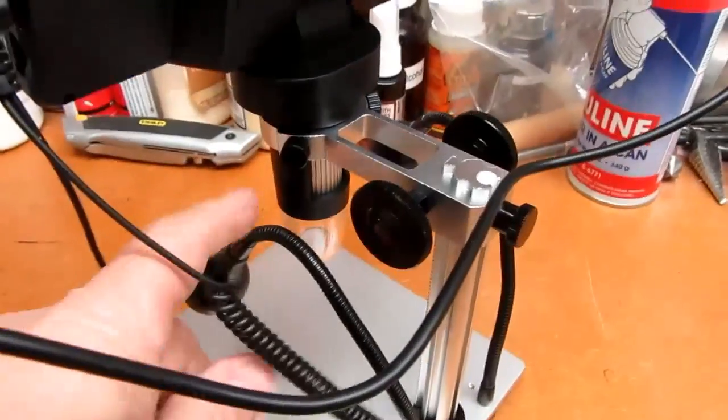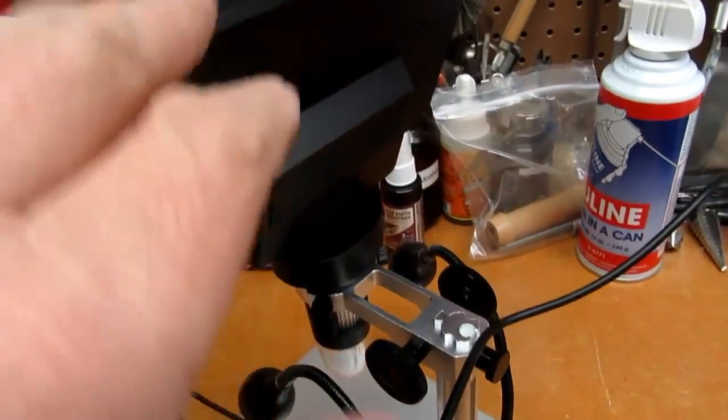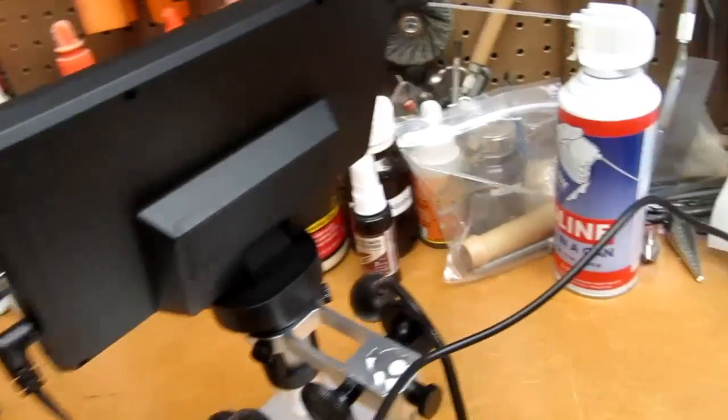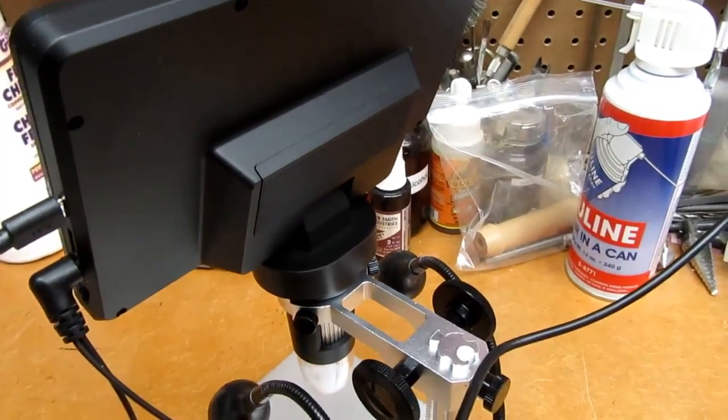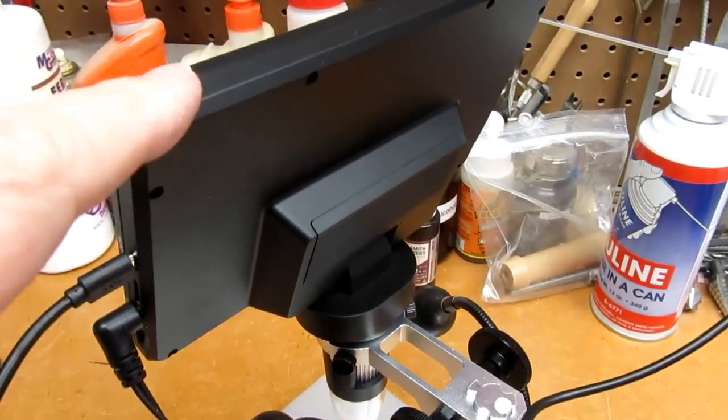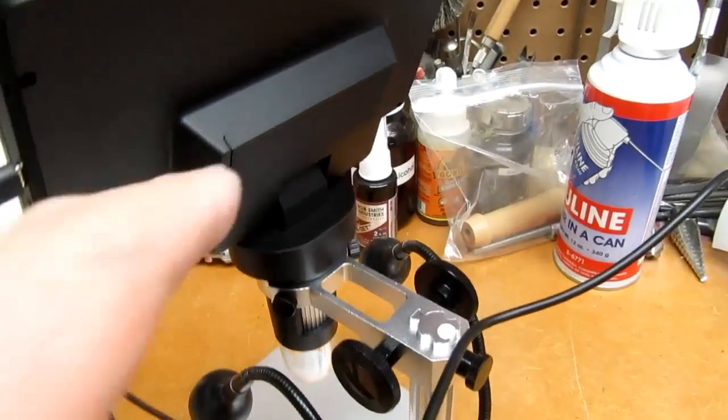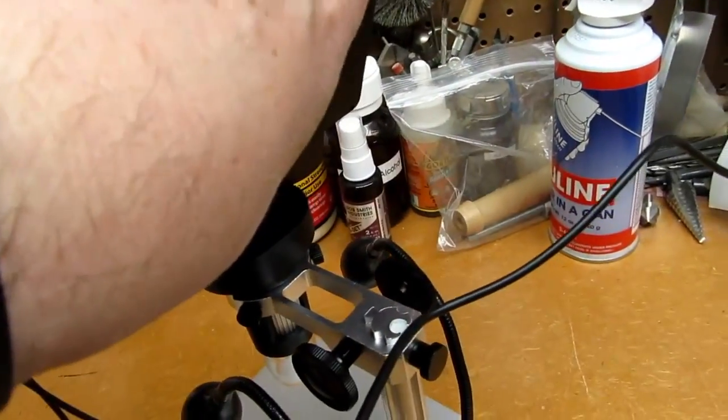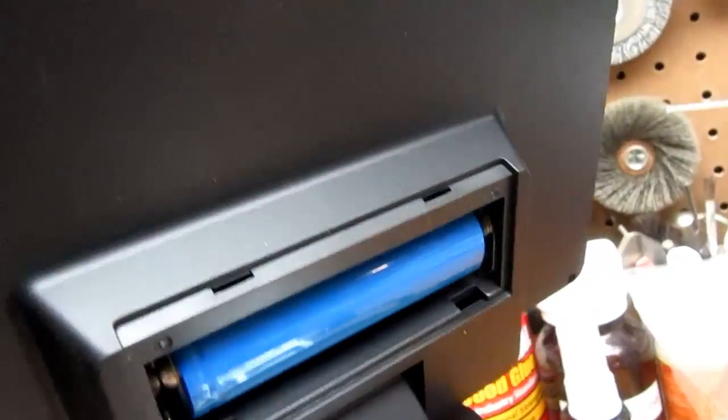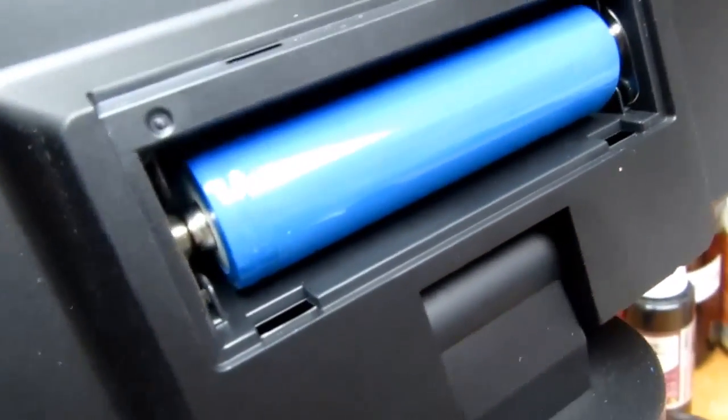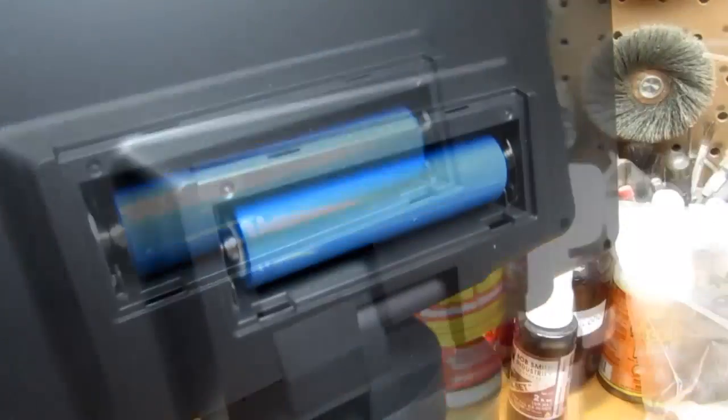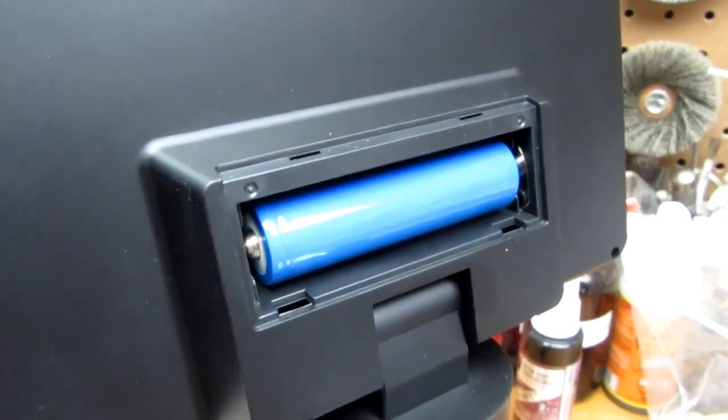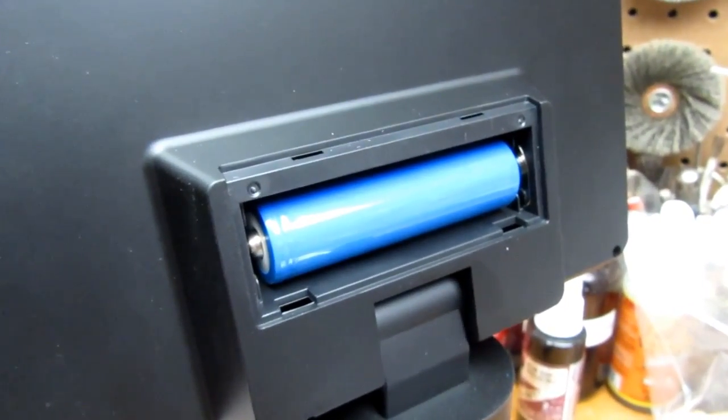The microscope does not come apart from the LCD display. I think the smarts, if you will, the logic circuitry for the microscope is in this part of it, as is the power supply. This is a battery compartment here. By lifting this panel up, the one and only rechargeable battery for the whole microscope is revealed. According to the manual this is an 18650 rechargeable lithium battery.